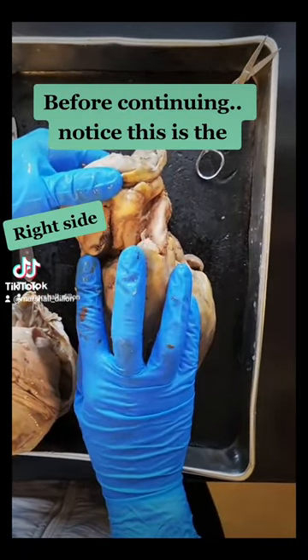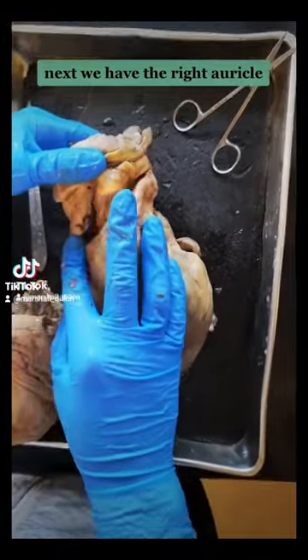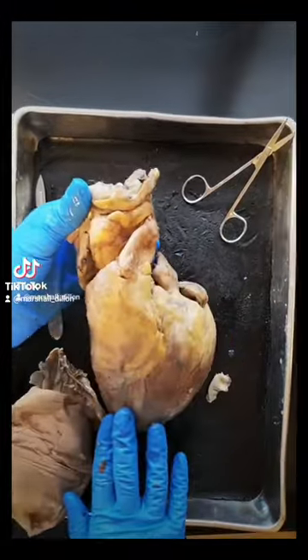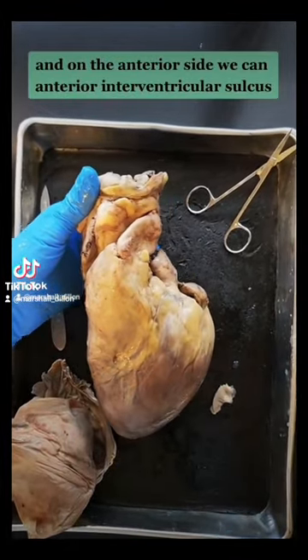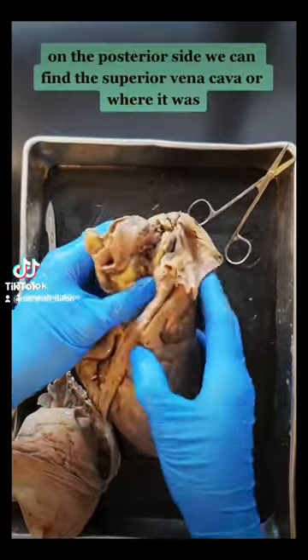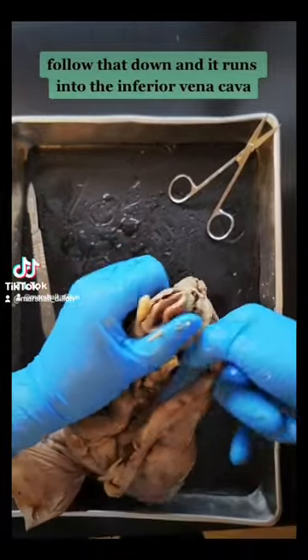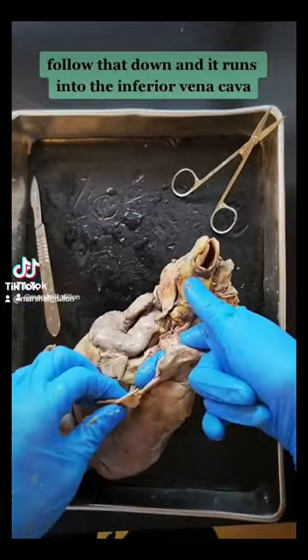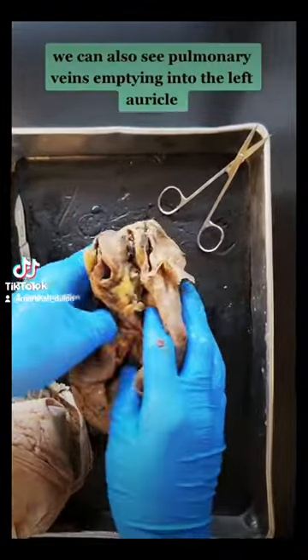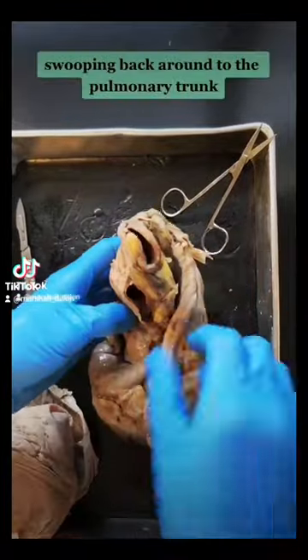Notice this is the right side and this is the left side. Next, we have the right auricle and the left auricle. And on the anterior side we can see the anterior interventricular sulcus. On the posterior side, we can find the superior vena cava, and following that down it runs into the inferior vena cava. We can also see pulmonary veins emptying into the left auricle, swooping back around to the pulmonary trunk.